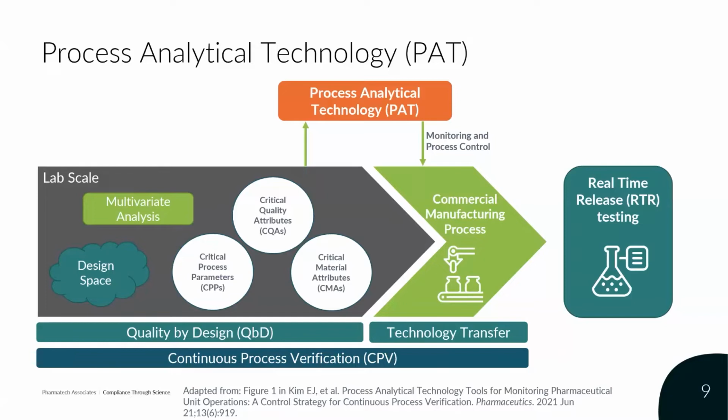Most of the data available that I'm going to talk about today describes real-time release testing, more or less in the context of a continuing manufacturing process. I do want to stress that a batch manufacturing process can also incorporate process analytical technology and therefore real-time release testing.